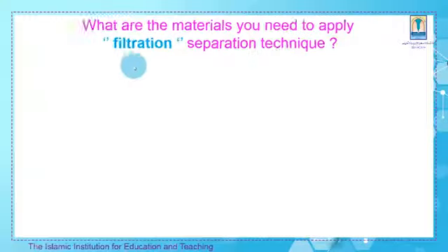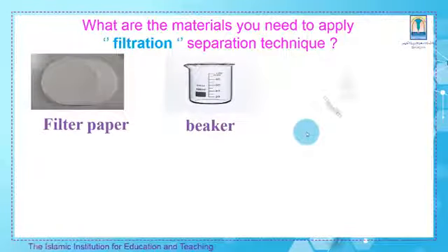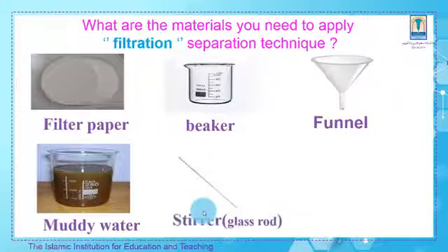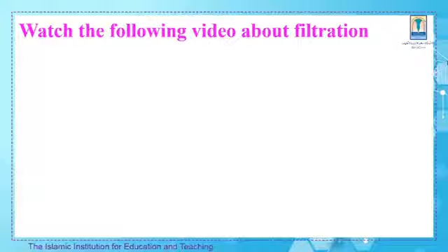What are the materials you need to apply the filtration separation technique? You need filter paper, beaker, funnel, muddy water, stirrer or glass rod, and a stand. Now, watch the following video about filtration.